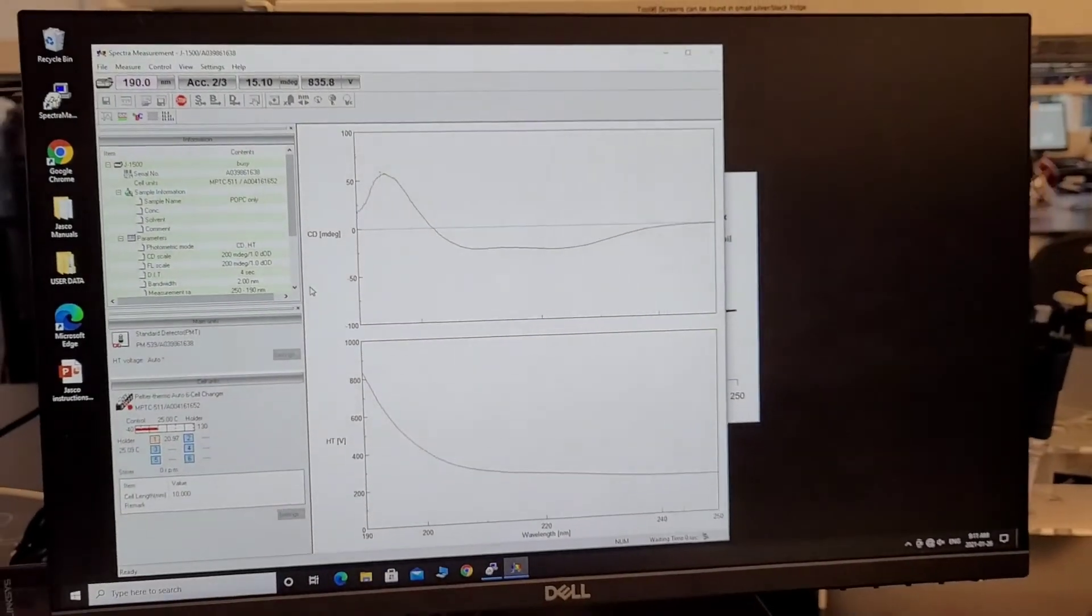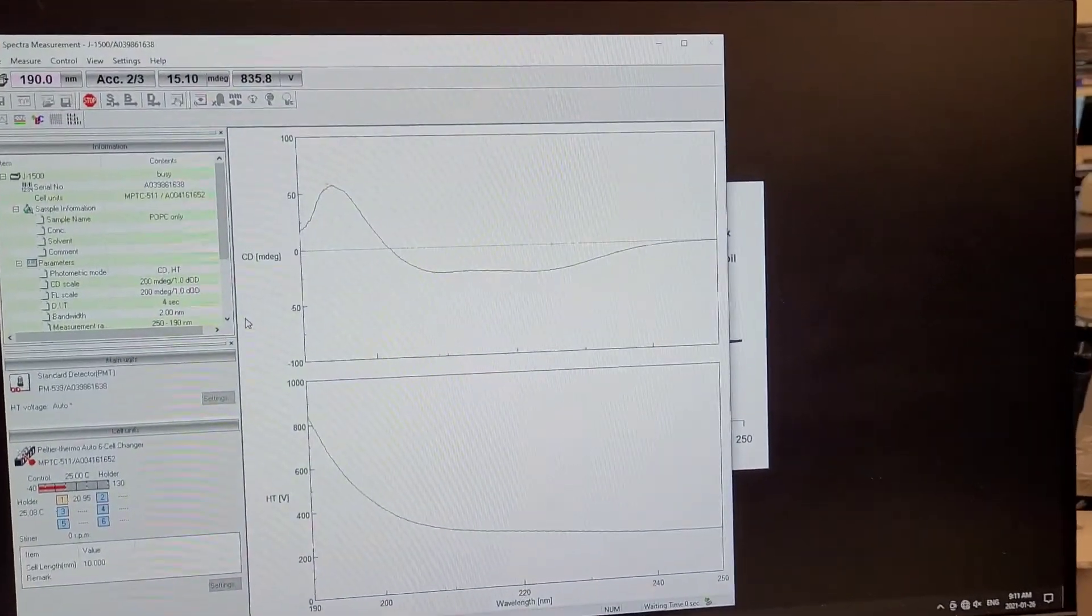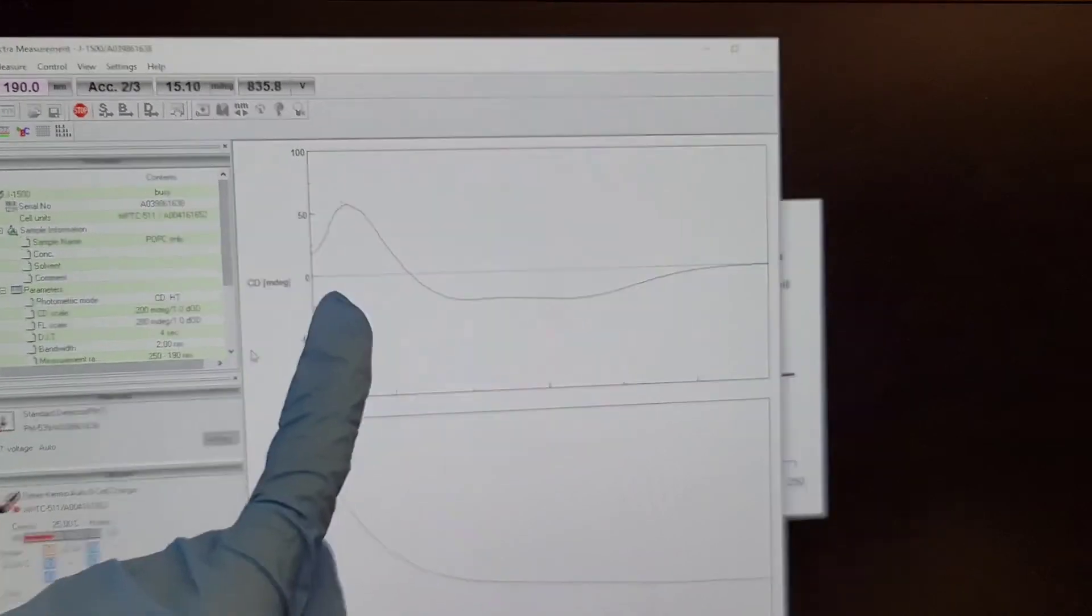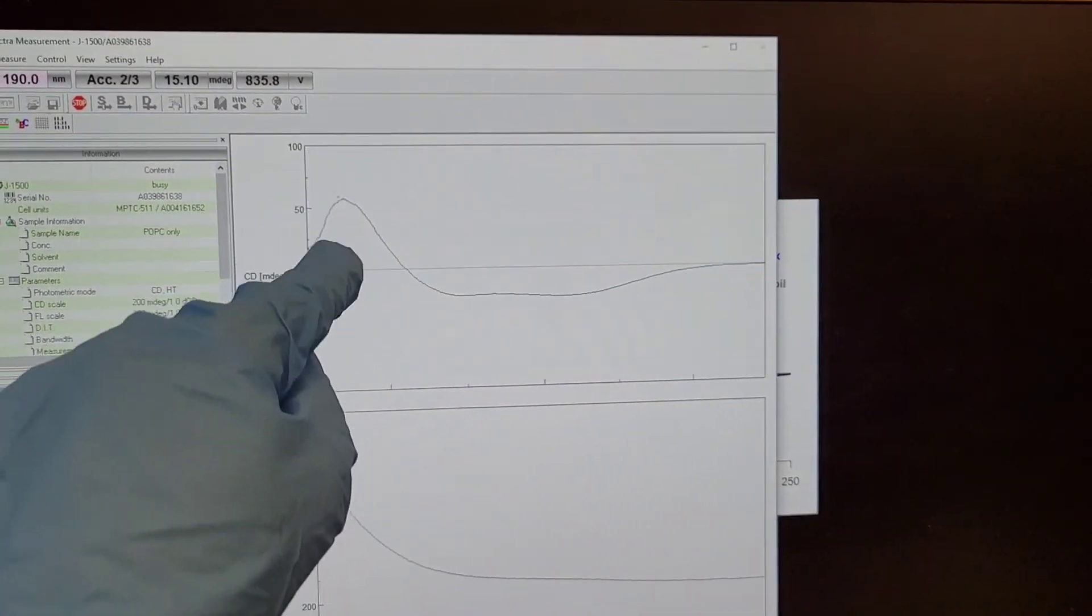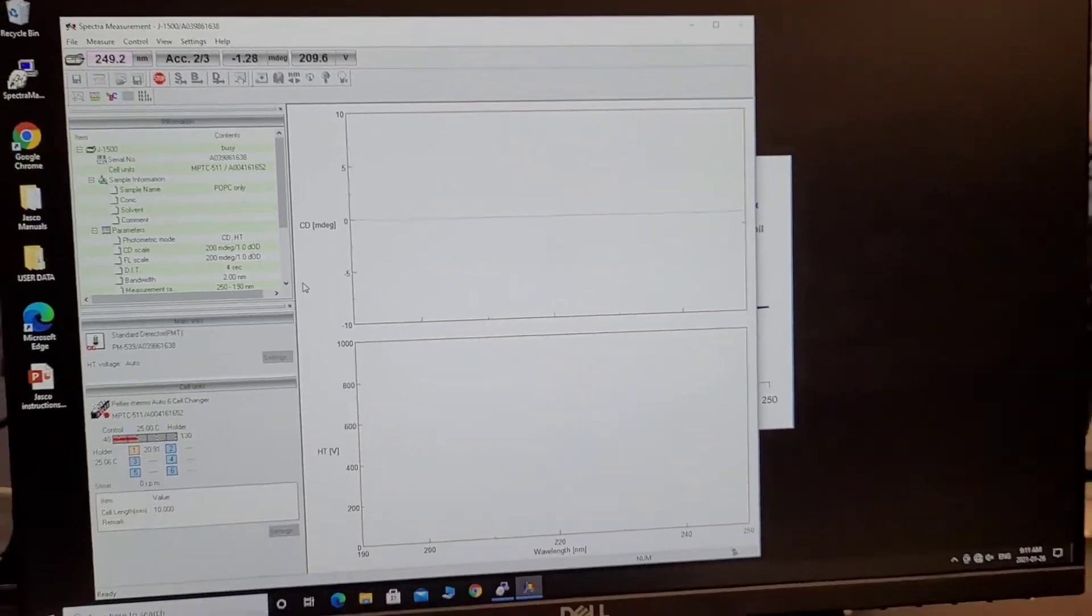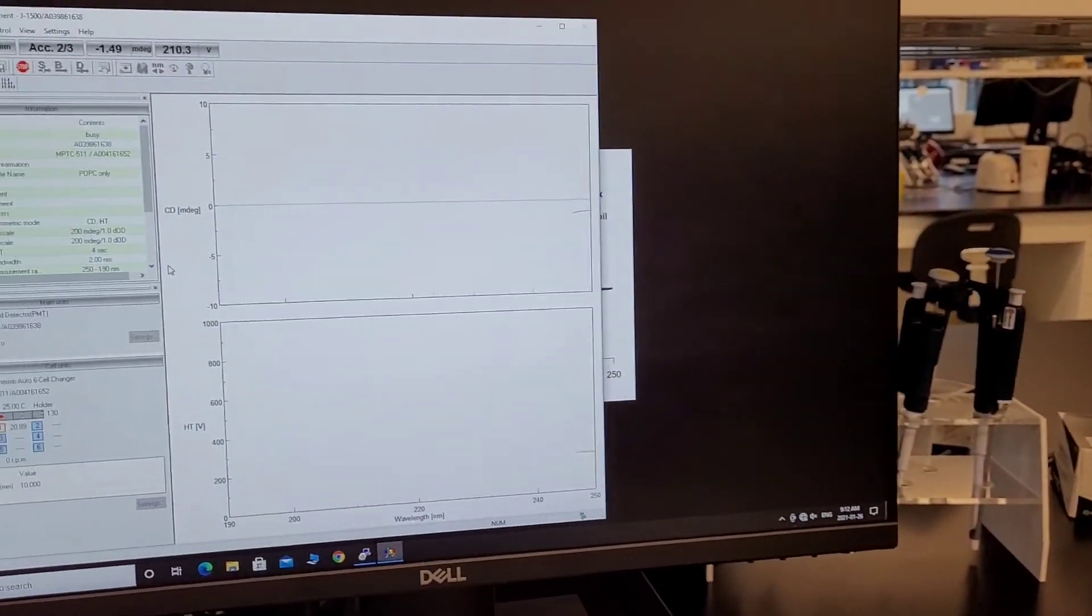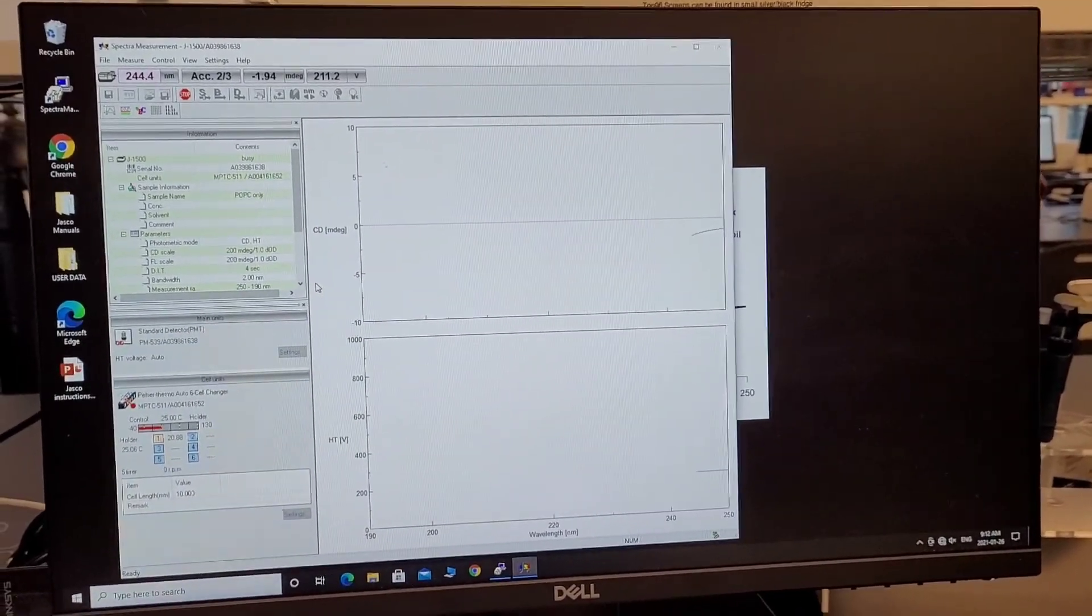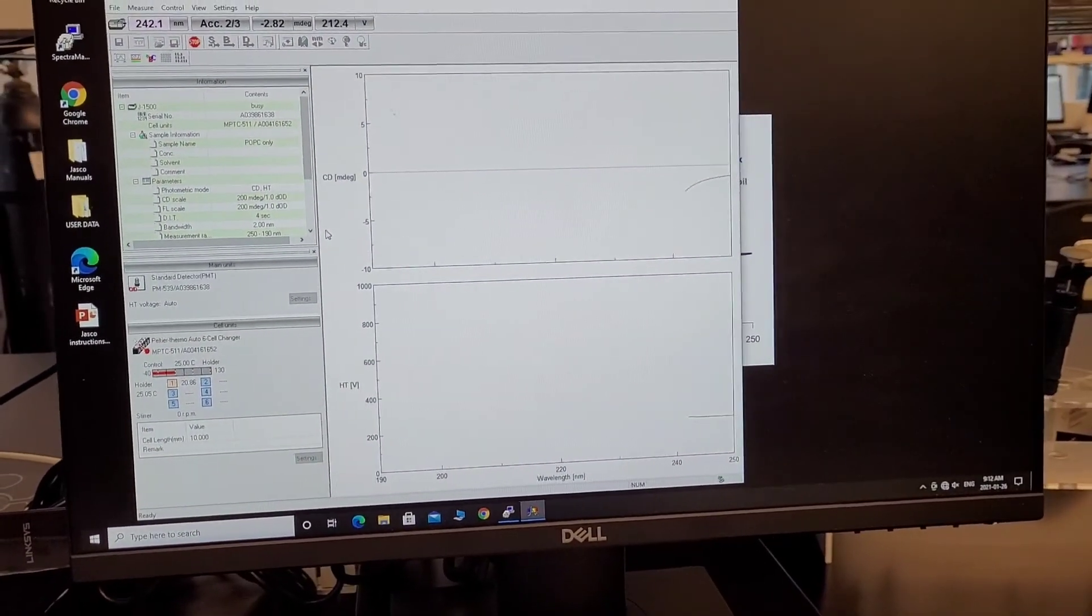Just forgot to show the end. This is a perfect, perfect alpha helical structure. If you have some salt in your buffer, you will see some lines going like this here. The solution to that is just dialyze your sample in a low salt buffer. That's it. Thank you. Bye.